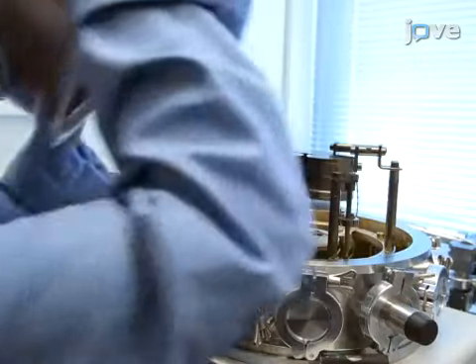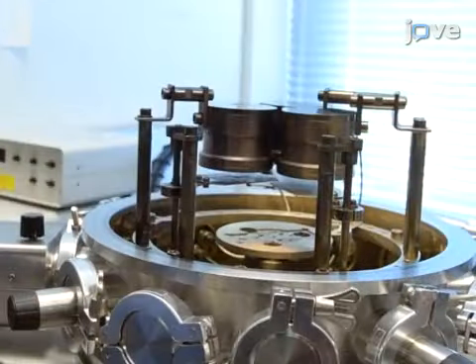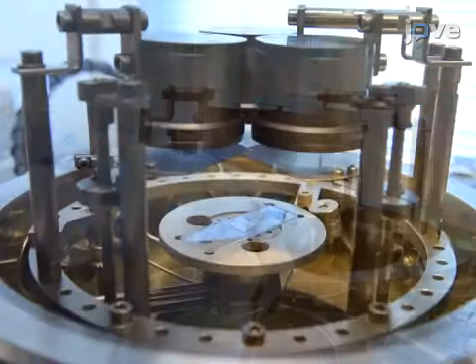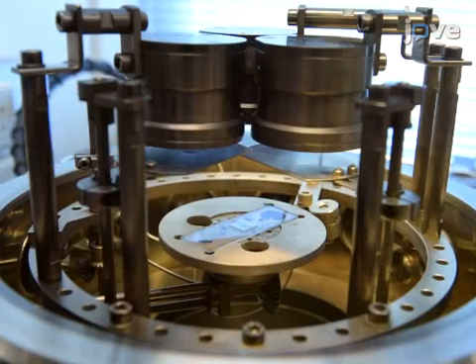First, clean a sapphire slide by sonication in 99.5% ethanol for 5 minutes. Then, using a sputter coater, deposit a 10 nanometer thick gold film onto the slide.